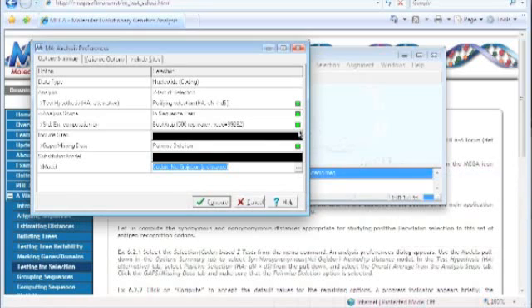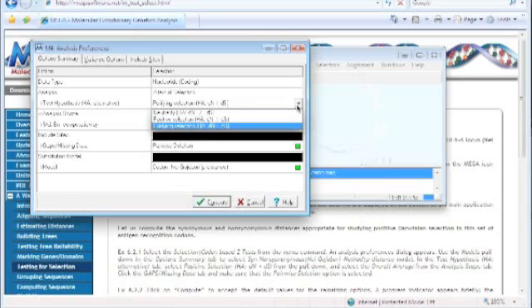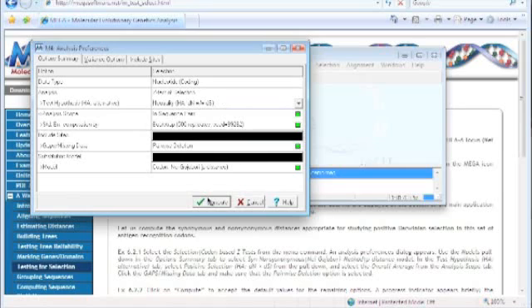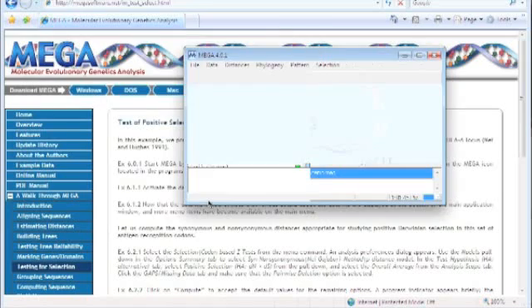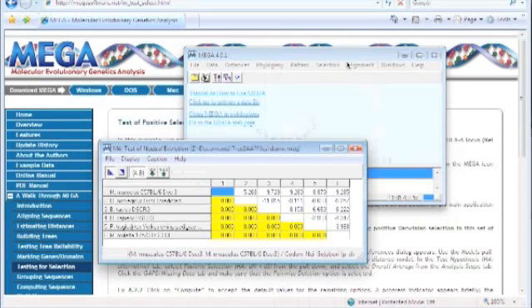Make sure that the gaps/missing data is set to pairwise deletion. Right here we can select our test hypothesis. Our null hypothesis is neutrality, and our alternative hypothesis is that the dN and dS ratios are not the same — then we select this one right here and run this. We're going to be testing to see the probability of neutrality — that there are just as many non-synonymous as synonymous mutations.